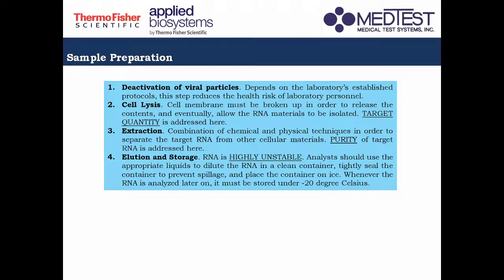So with that, analysts must be sure that they follow the appropriate protocols. So you use the appropriate liquids to dilute your RNA, and then you use a clean container, and then you also seal the container to prevent spillage, and then place the container on ice.